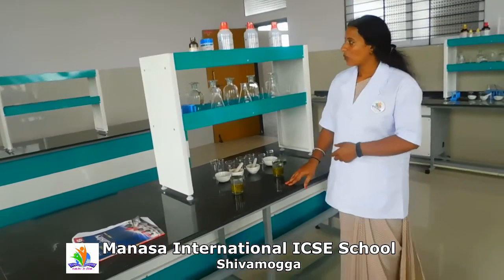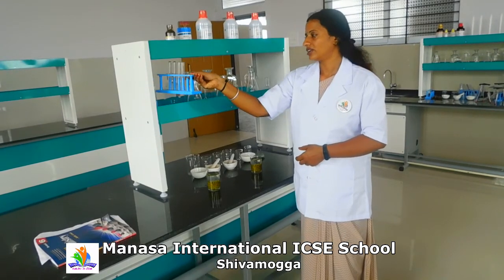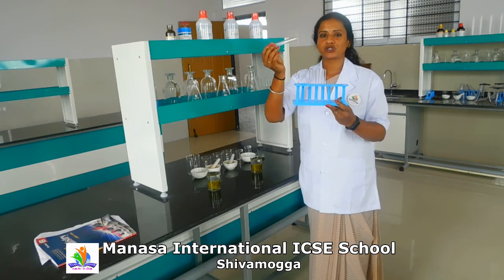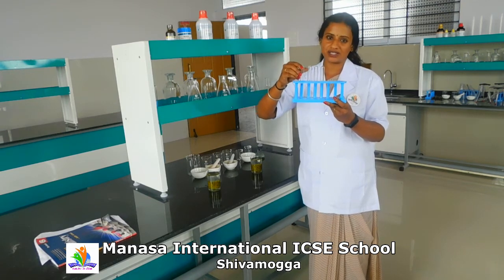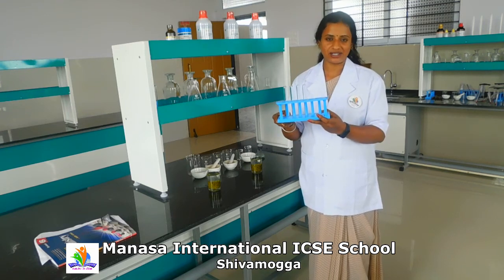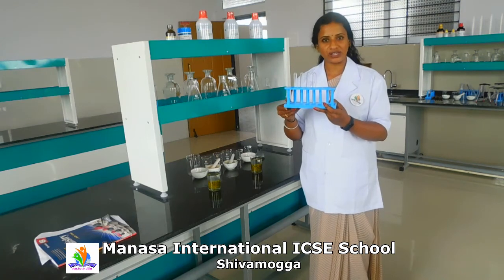Coming to the next, we have the test tube stands. This is called the test tube, and the test tubes are placed in the test tube stands. All these glass apparatus are made of borosilicate glass. I repeat, all the glass apparatus are made of borosilicate glass.